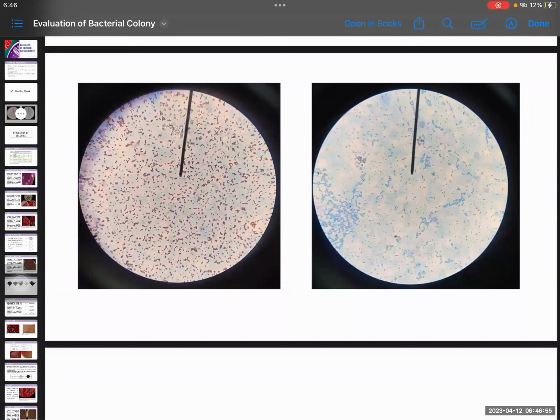And you can also notice it on the actual growth. Macroscopically, using the naked eye, you're going to be able to observe that the appearance is really different: the color is different, the size is different, the arrangement, and so on. And most of the time, the most common contaminant is actually fungi, so you're going to observe some moldy or fluffy growth. Those are very indicative of fungal contamination, since fungi spread easily because they have spores. So it's a very common contaminant in the bacteriology section.